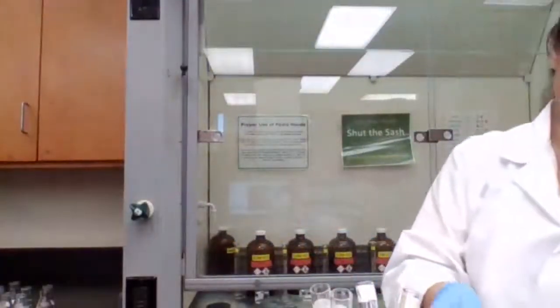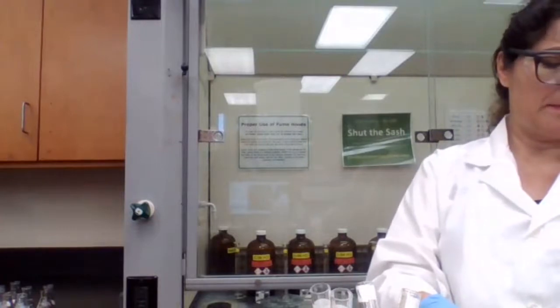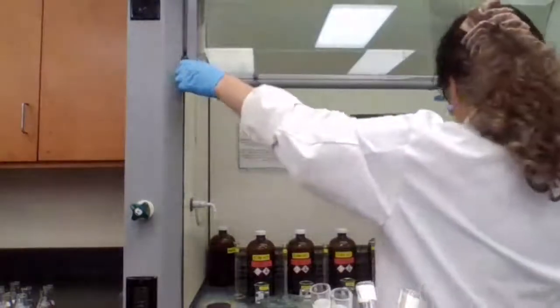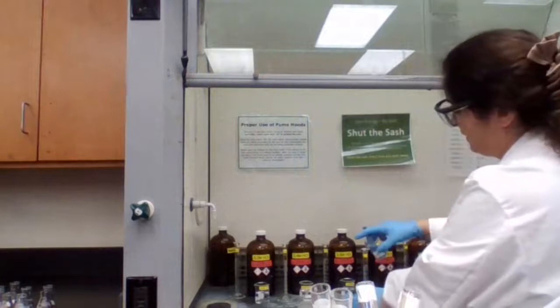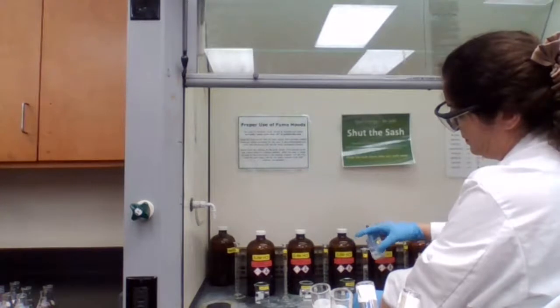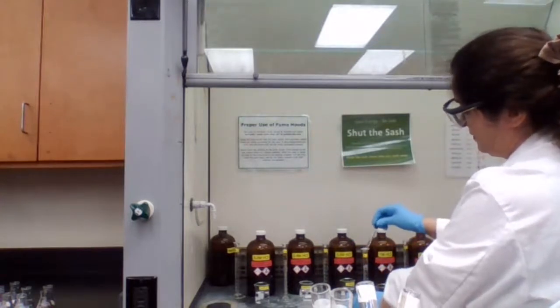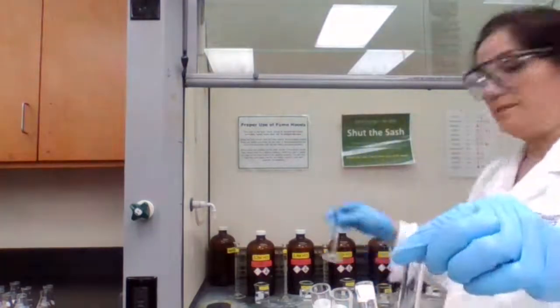So we are going to place 10 milliliters of 1 molar in test tube 1. I have 1 molar, adding 10 milliliters to test tube 1.